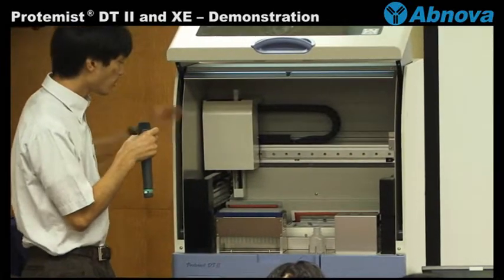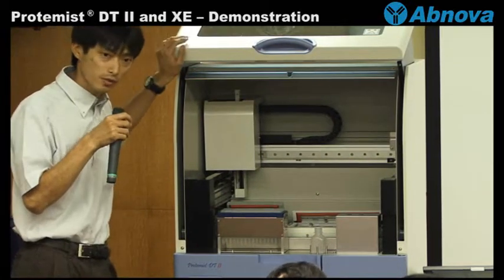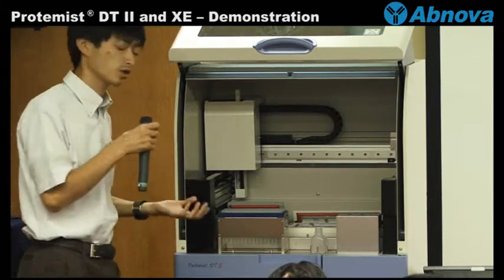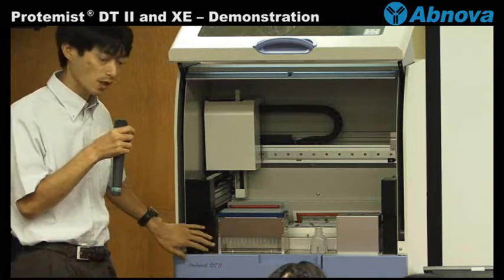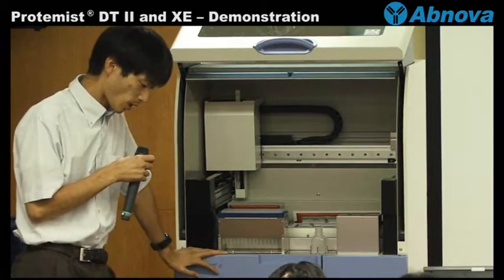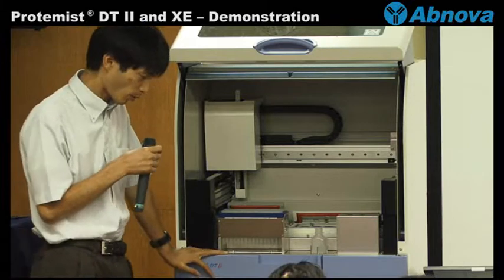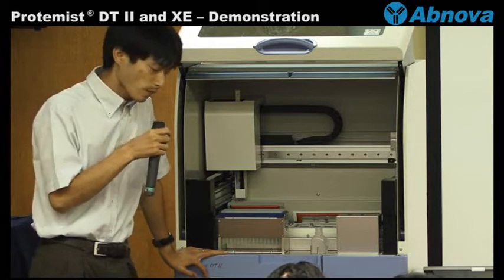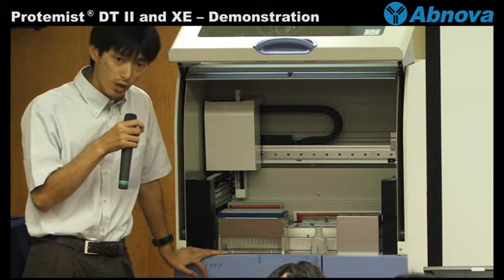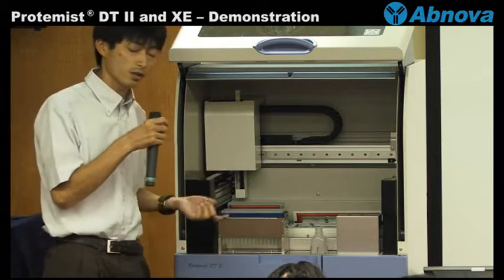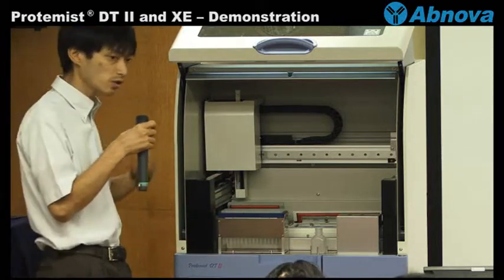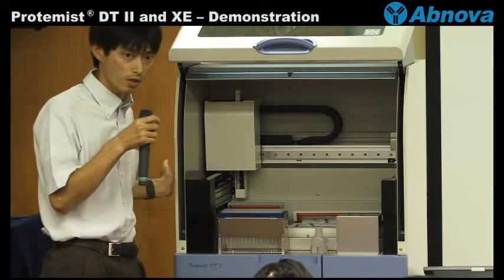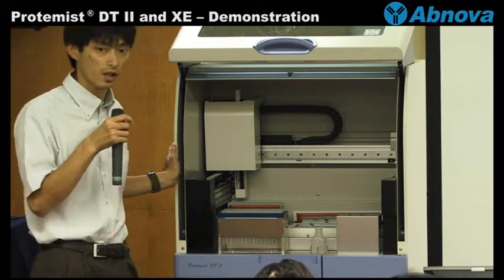And this will complete six samples for one run, so that you can get six different proteins per run. And if you choose another program for translation at 26 degrees for eight hours, it takes about 23 hours including transcription, translation, and purification. So that the next day you can get the purified protein. It's very easy and very quick. You can save the labor.